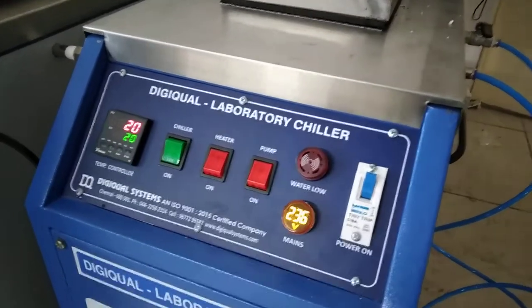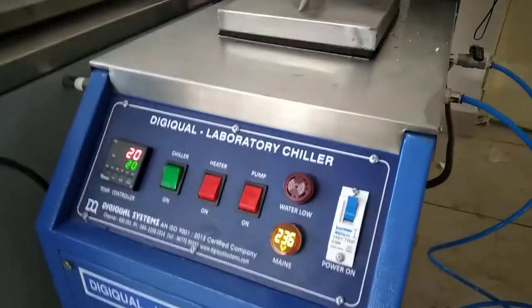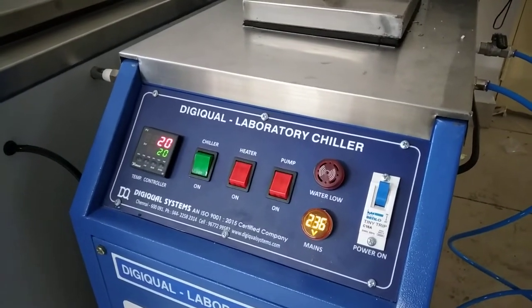Hi, welcome to DigiQual page. Today we are going to see about the laboratory chiller, laboratory recirculating chiller.